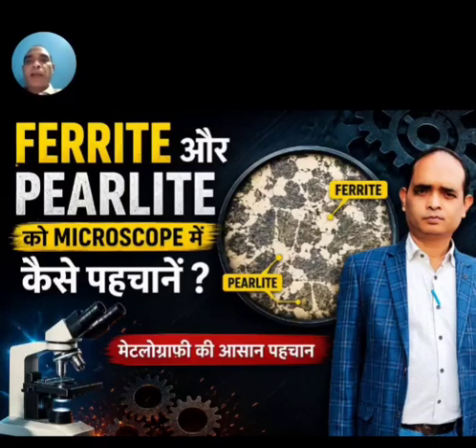Under an optical microscope, ferrite appears as bright or white regions after proper etching with nital. Ferrite grains are generally polygonal in shape with smooth grain boundaries. Key properties of ferrite include soft, highly ductile, good toughness, magnetic at room temperature, low hardness, and excellent formability.